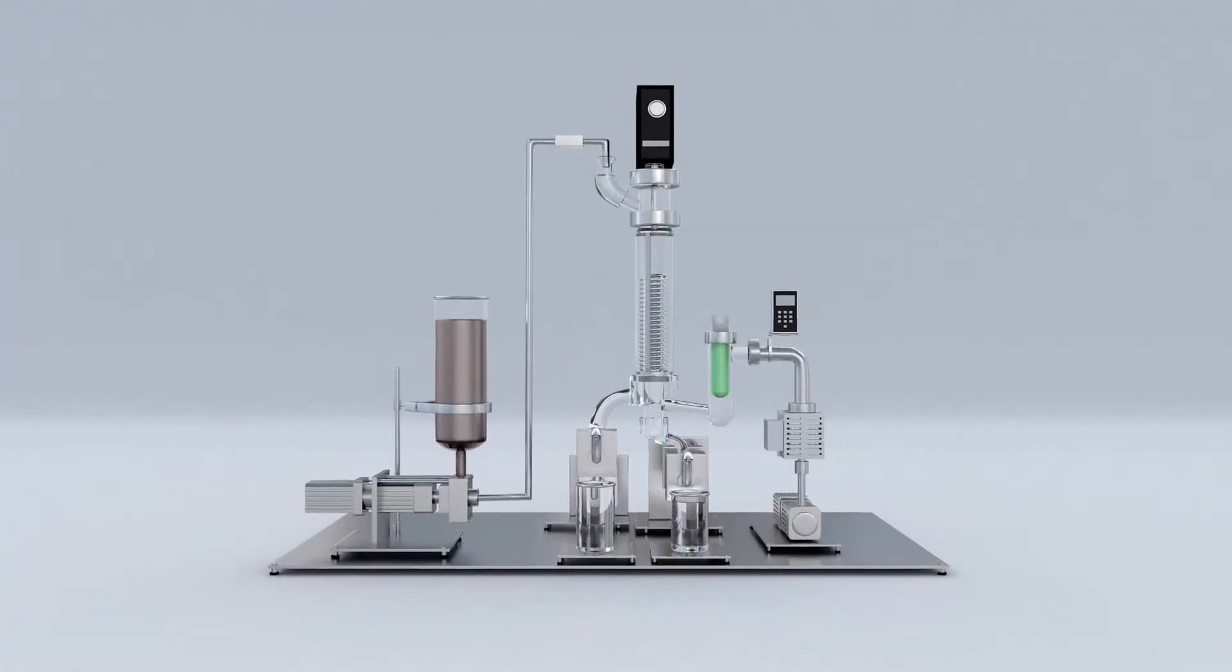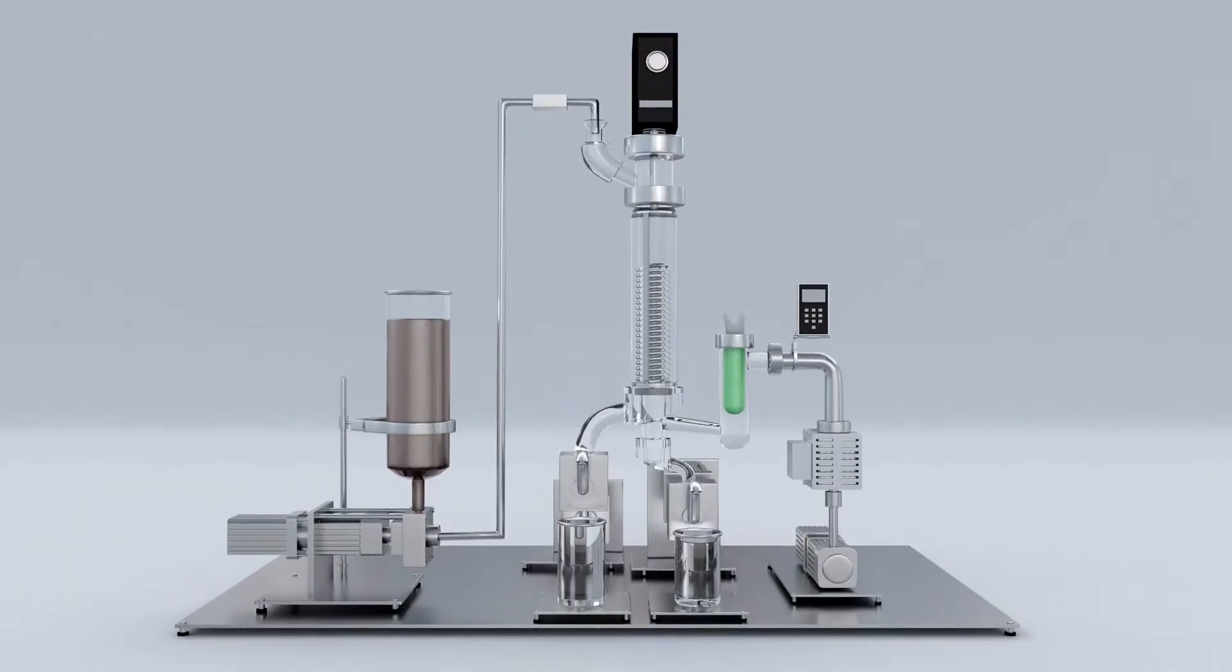Wiped thin film distillation, sometimes called molecular distillation, is the separation process where fluids with different boiling point temperatures can be separated with great efficiency and high purity.